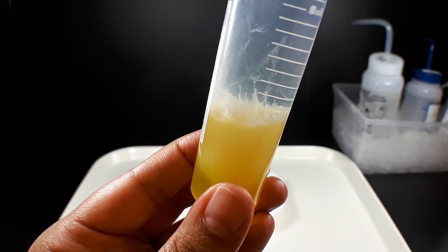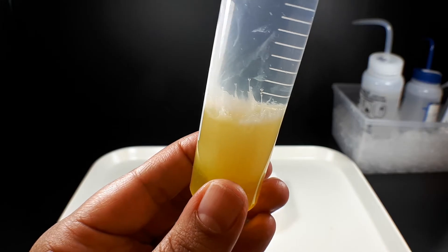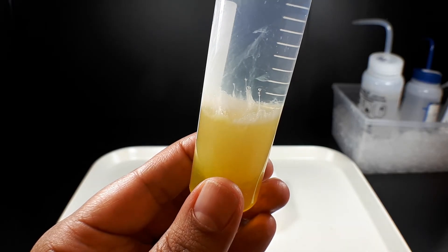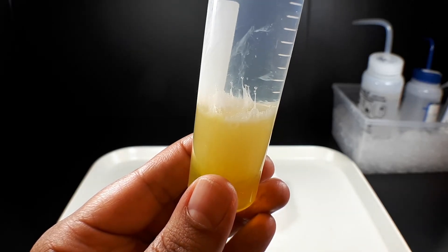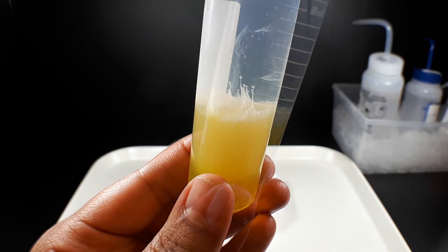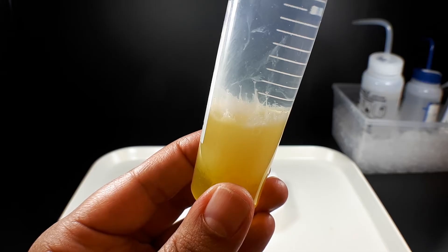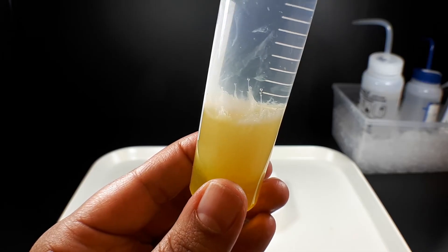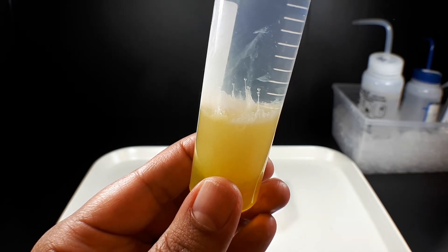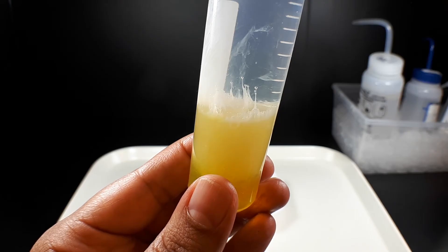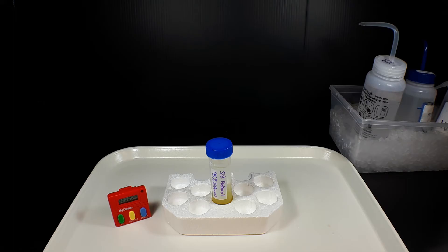You can almost immediately see the DNA start to precipitate at the interface between the extraction mixture and the ethanol. This happens because the salt that we added earlier can now neutralize the DNA and make it hydrophobic. So now, the neutralized DNA essentially wants to get away from the water extraction mixture, so it clumps together and moves into the ethanol. The DNA needs some time to fully precipitate, so we return it to the rack and let it sit for at least 10 minutes.